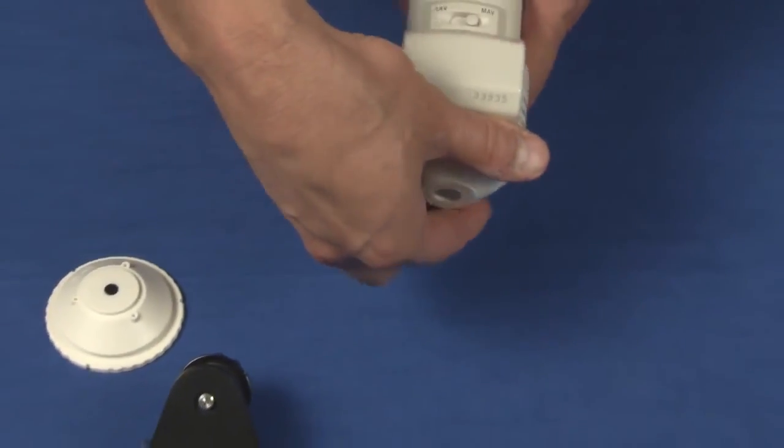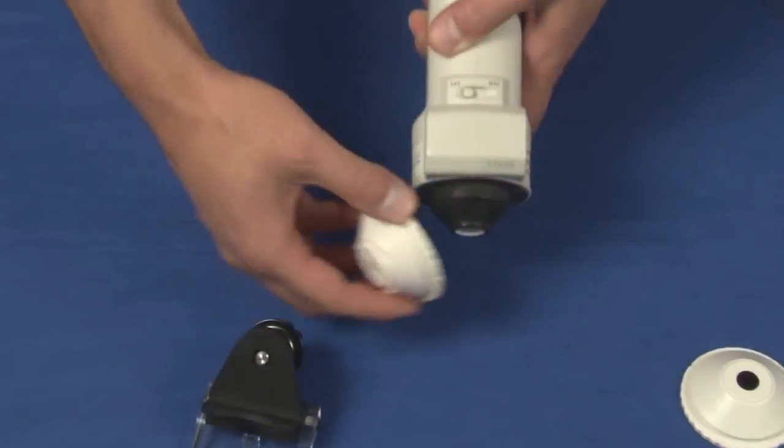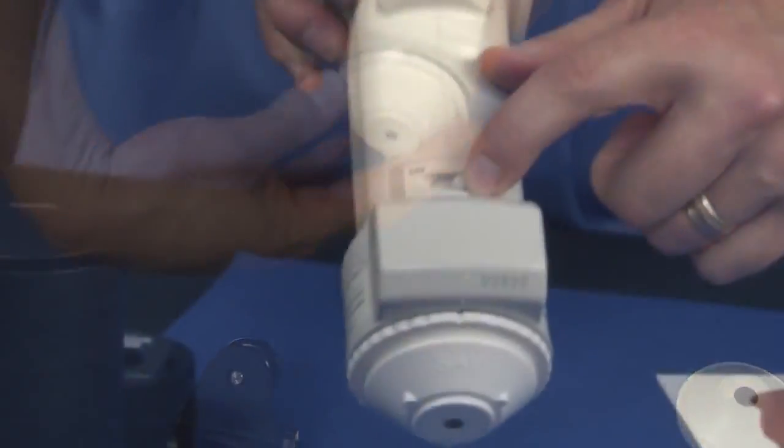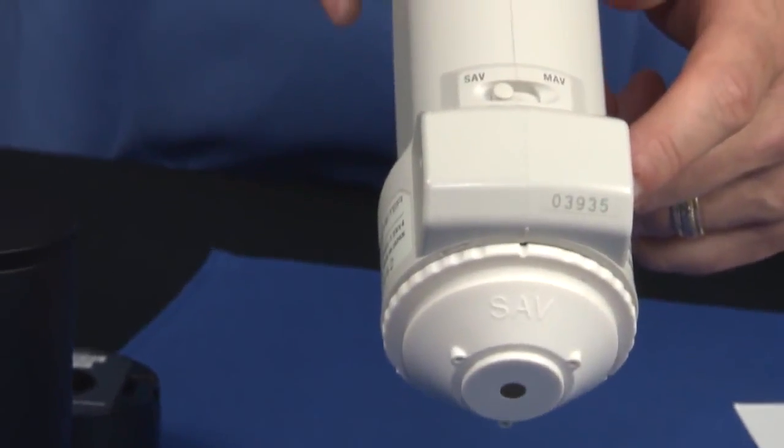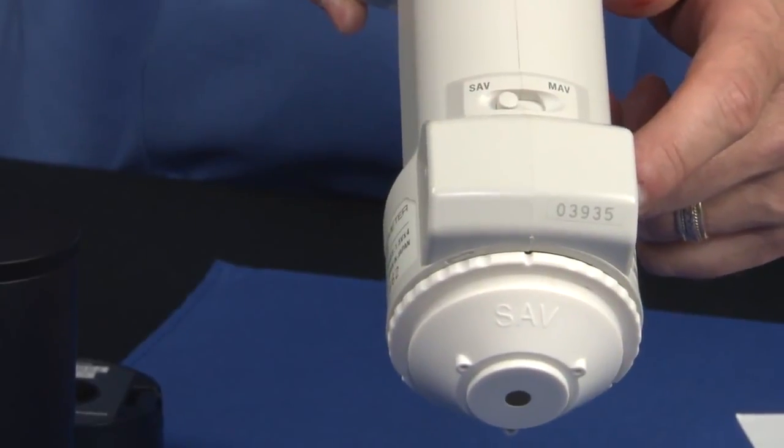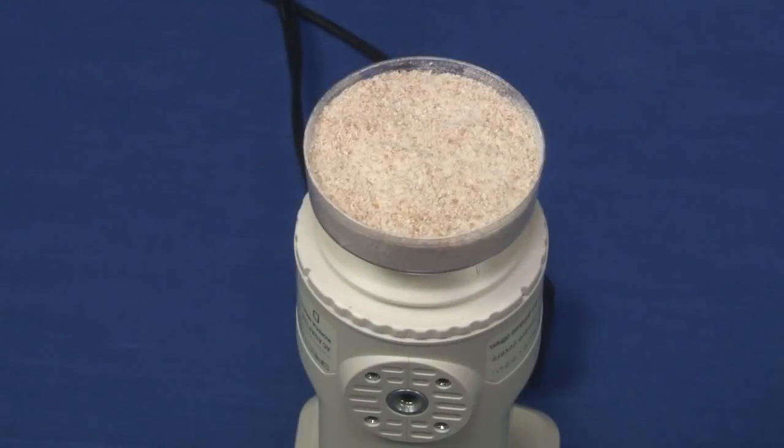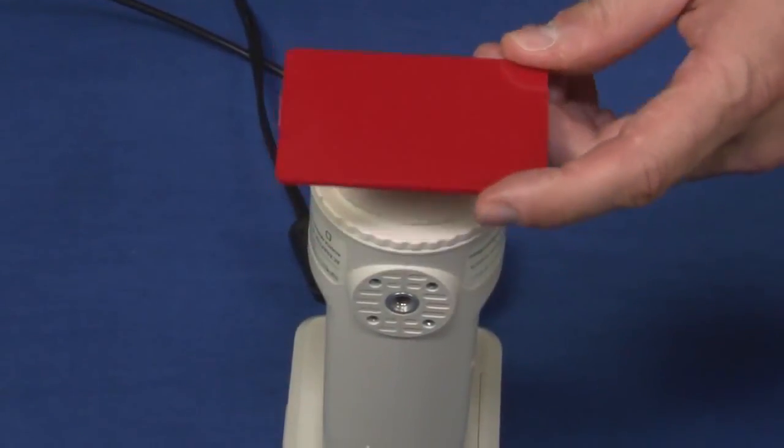The measurement aperture is selectable between 8 mm and 3 mm according to sample size. For example, the 8 mm is suitable for measuring the average of non-uniform samples, and the 3 mm will measure uniform samples.